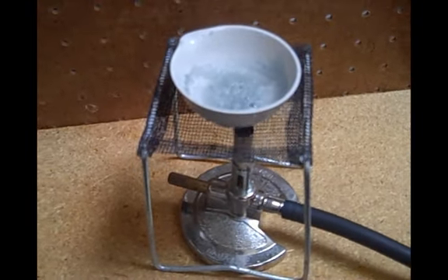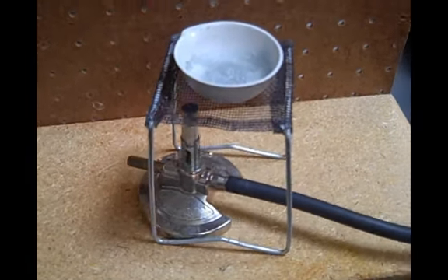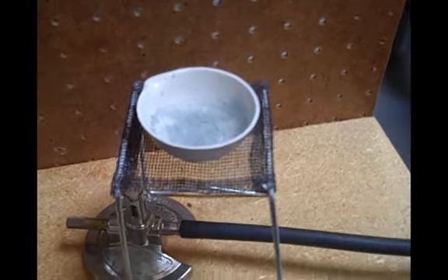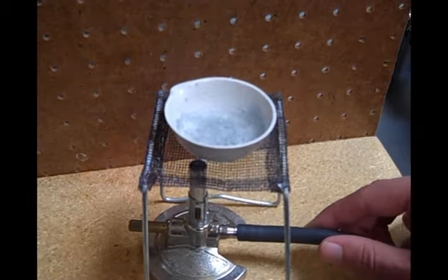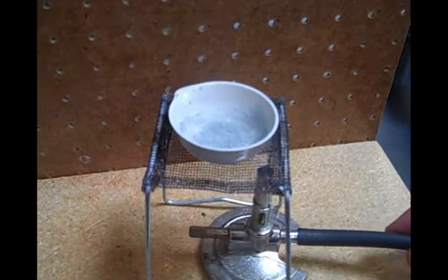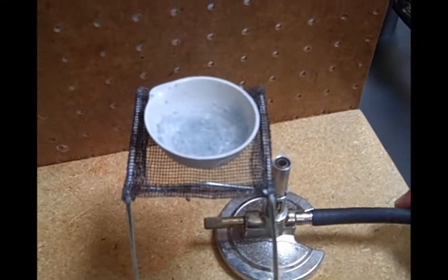So as you can see, a lot of our water is beginning to evaporate and we're left with just the solid that we dissolved in there. We want to be careful towards the end here to make sure none of our solid is splattering out. So I'm just moving my Bunsen burner back and forth to keep the heat dissipated throughout the evaporating dish, trying not to lose any of my solid.